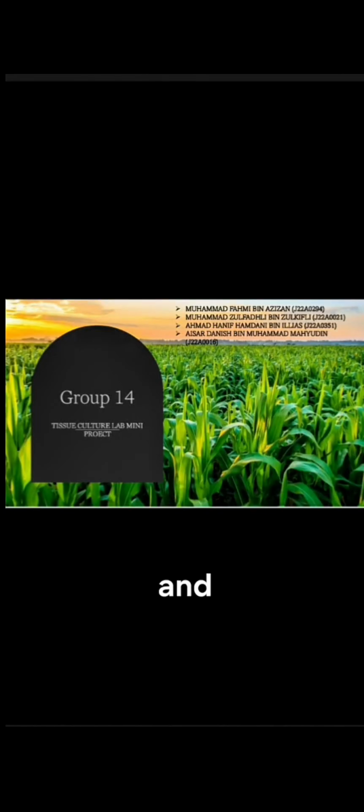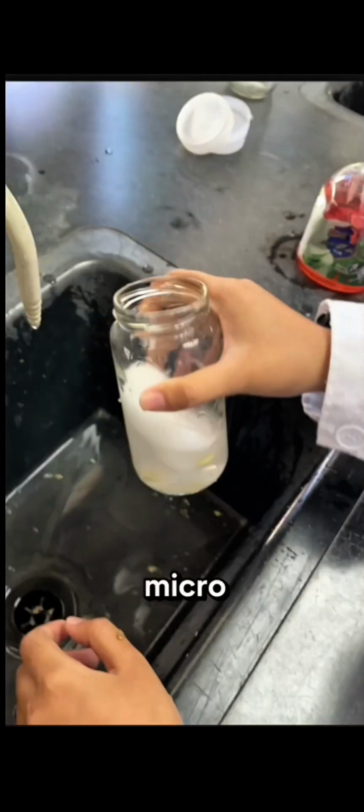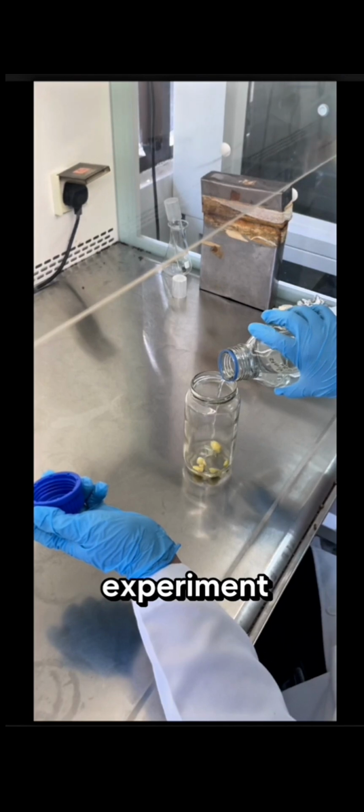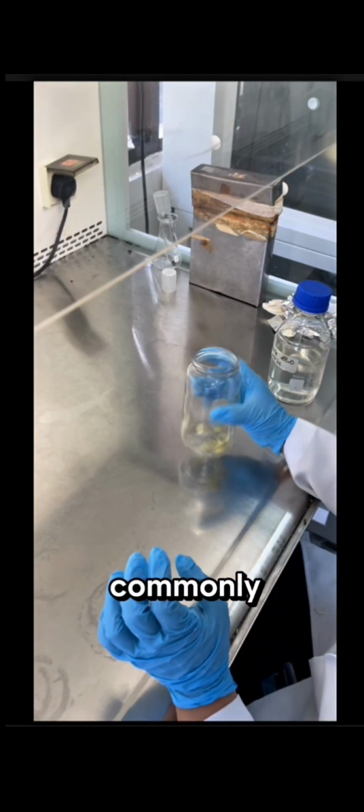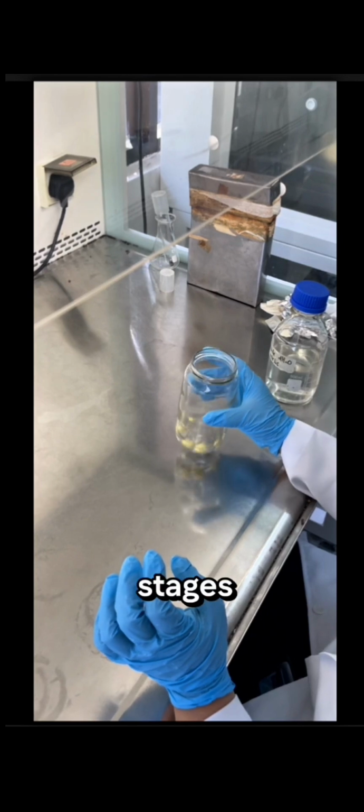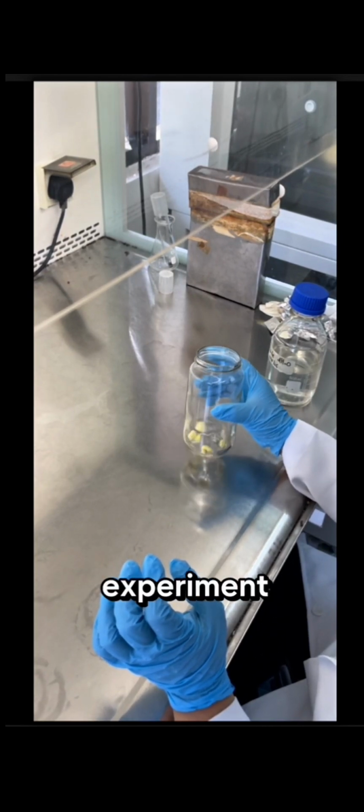We are Group 14 and today we will be presenting about the stages of micropropagation. In our experiment, we focus on the micropropagation process of Zingiber officinale, which is commonly known as ginger. There are 3 stages that we have done throughout the experiment.